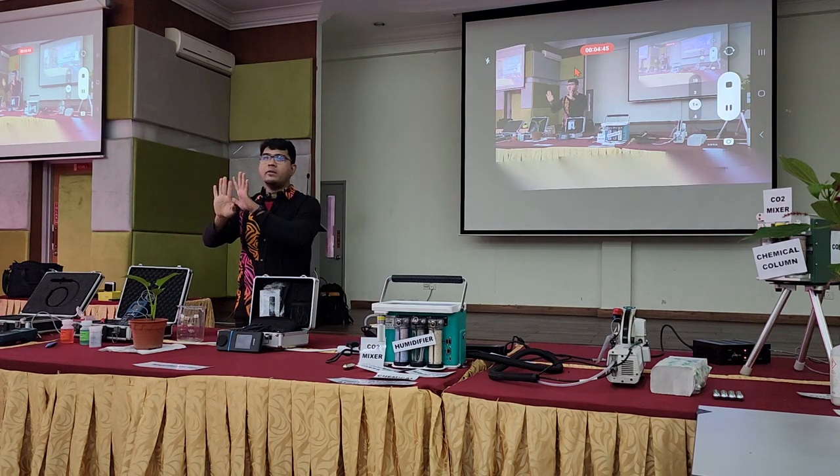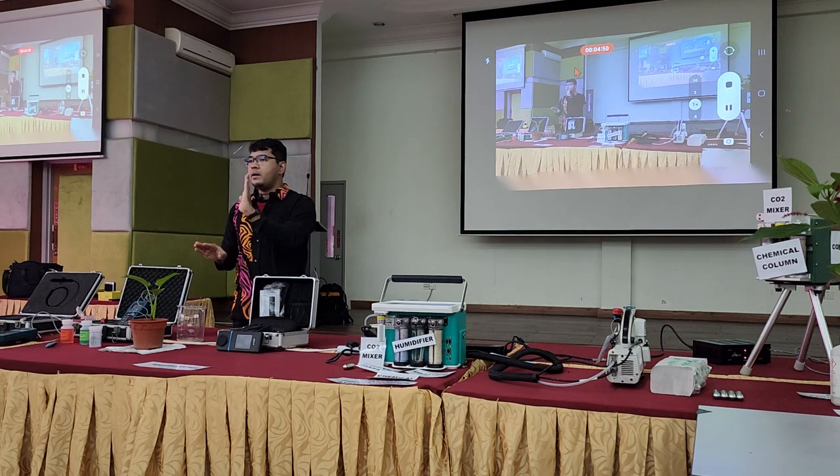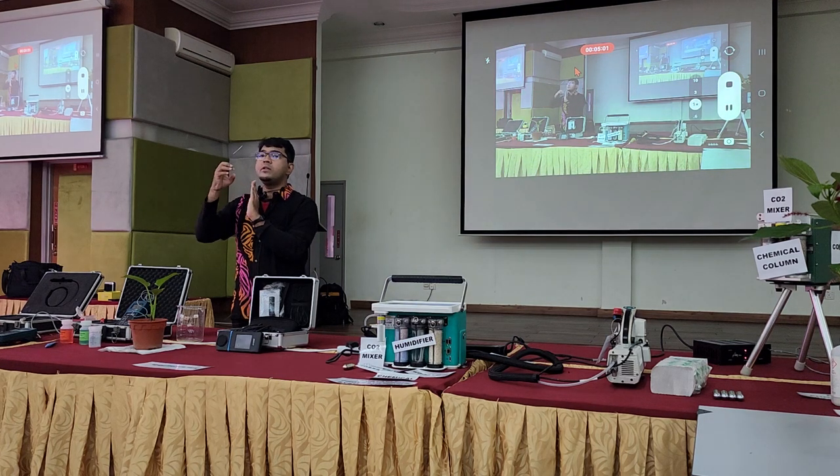Here's what's going to happen. I'm going to talk about these equipments, then you need to make an association in your head. This equipment, is it measuring the processes in the plants? There are many processes in plants. Or is it measuring the growth conditions surrounding the plants? Because you cannot run away when you're talking about growth and development. It's talking about the processes leading to the growth and development, and also the environmental cues or signals that cause this growth and development to occur.